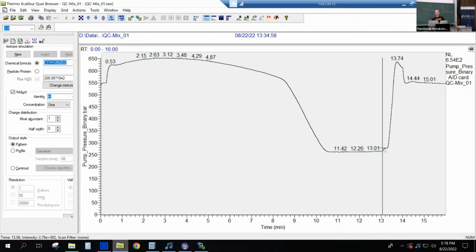Before we then, after the re-equilibration phase, come back up, and then it should get flat. Now if any of these phases is too short, I will see this in the pressure profile, right? I recently saw a photo on Twitter from somebody who had only half a minute re-equilibration time in his method, and he was sharing a screenshot, and I thought, oh, how does that work? How do we get starting conditions? That is really important, because if you do not have that, then on your next injections everything will run through immediately. You get really bad chromatography.